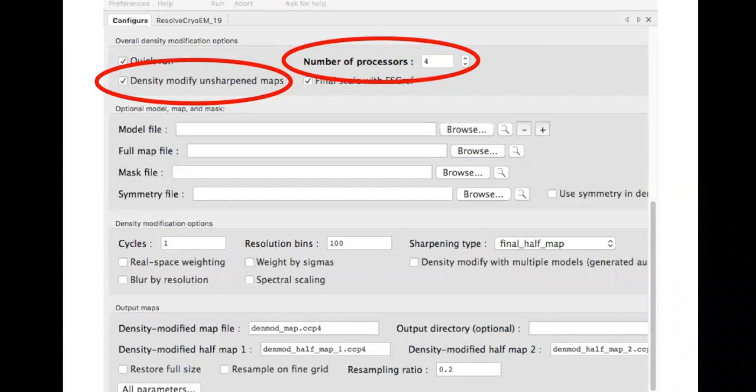The procedure assumes that the solvent has fairly uniform noise levels. But in a typical cryo-EM map, the solvent noise is very high near the molecule and very low far away. So by boxing it to make a smaller region, the uniformity of the solvent noise is more constant. So you can do that yourself if you want.